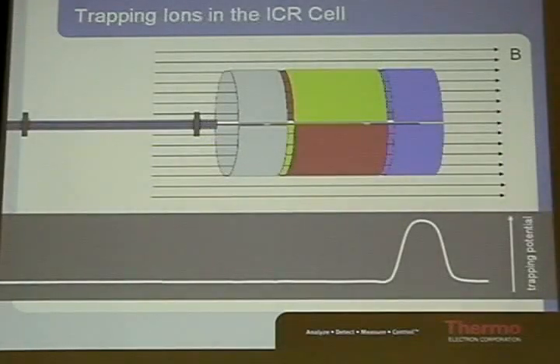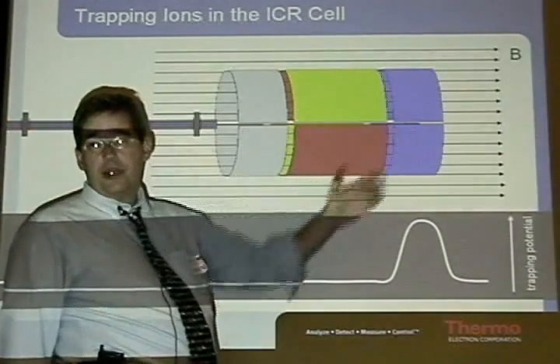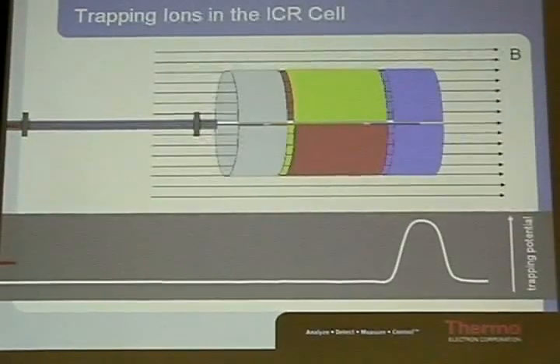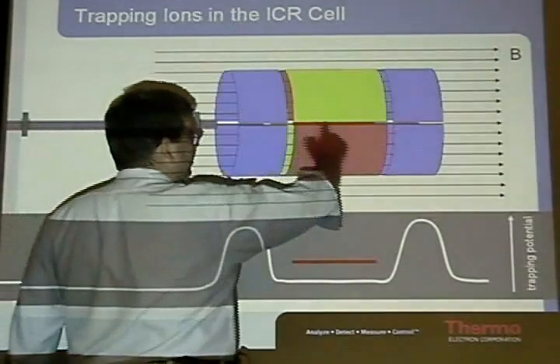Okay, now, so here's a picture. So here's the ions in the linear, and they're going to come down through the transmission optics. This FT operates in a very similar fashion to the LTQ. We've got a trap in 3 dimensions. And just like the LTQ, we use the front section and the end section to provide Z trapping. So we drop the first section down. Down come the ions as a packet. When they enter, we raise the first section up and we trap them. And they go harmonically back and forth.